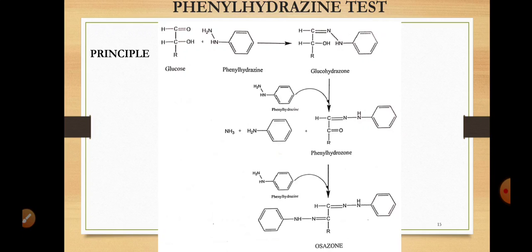When carbohydrate is warmed with excess of phenylhydrazine hydrochloride, because you can see in the 3 steps we have made use of successive phenylhydrazine addition.